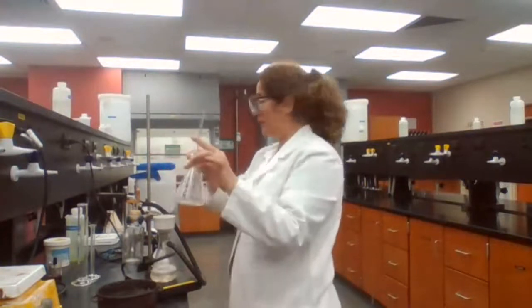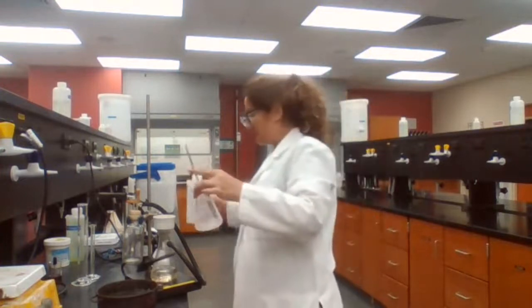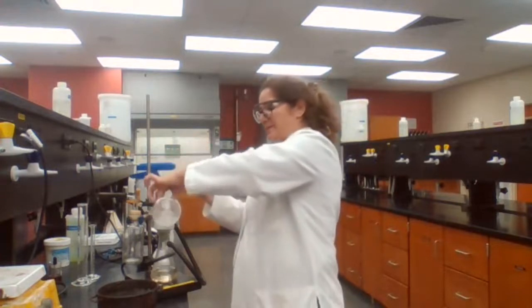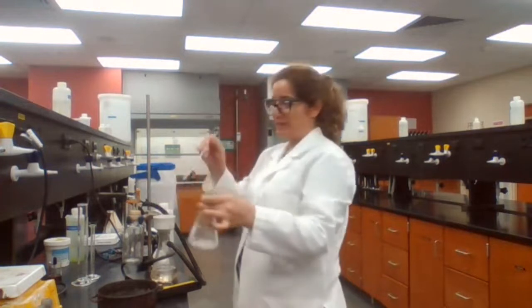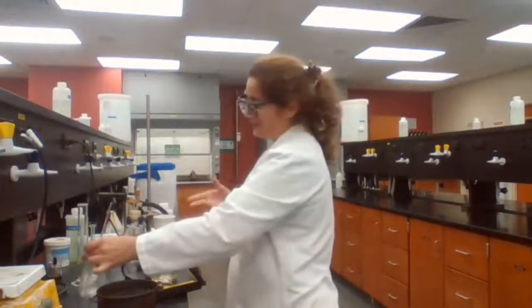If there is any leftover in the flask, I use ice cold water. This has been placed in the ice bath for a long time and it's really cold. Why does it have to be cold? Because I do not want to melt my sample at this point. If the water is room temperature, some of this sample is going to melt.